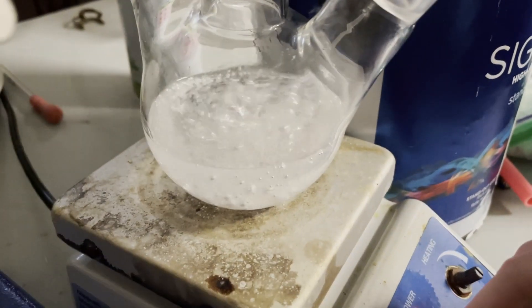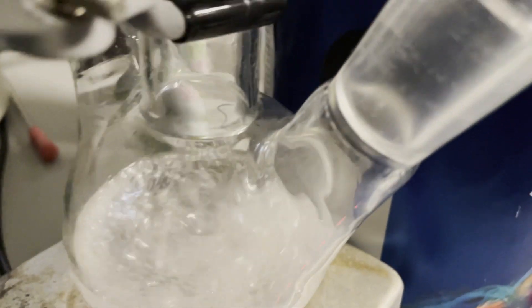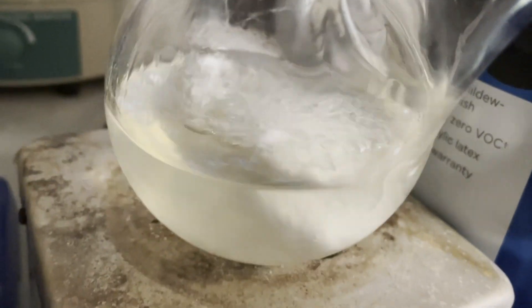Now naturally, as the reaction was running and it having to be extremely anhydrous, of course a massive thunderstorm — the biggest one I've seen yet of the year — decided to roll in right then. I have to have the garage open though because the reaction is producing a lot of hydrogen, so I can't really be dealing with this right now.